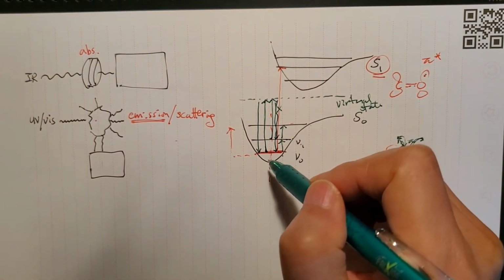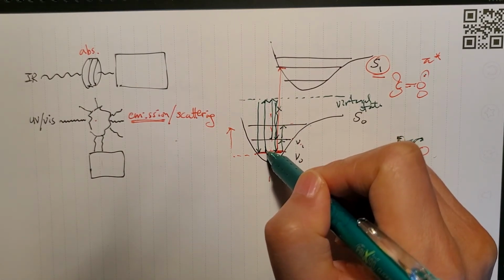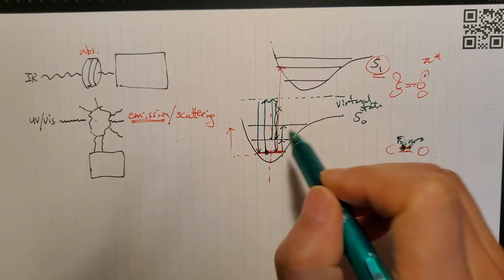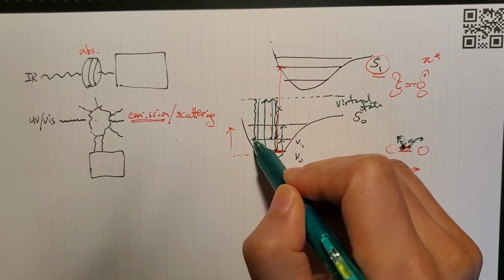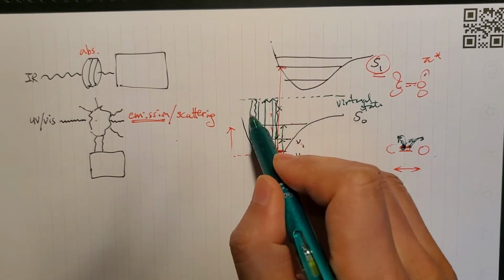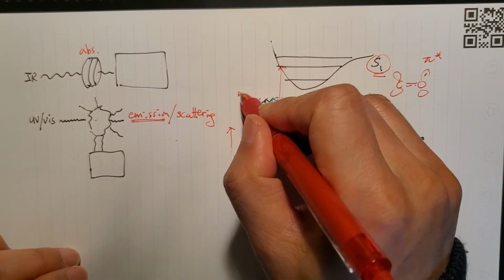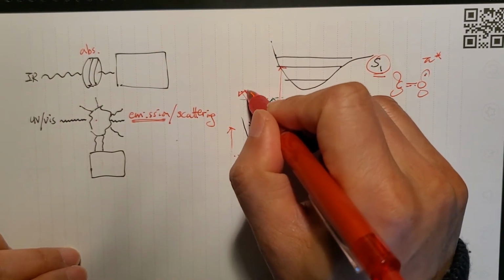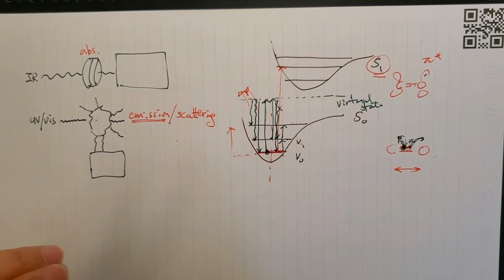And also you should know that it could come down here when you excite from there, but like I mentioned here, it may also end up coming down here or just there by emitting photons. Okay, so this photon and this photon possess less energy than the original energy that we used.